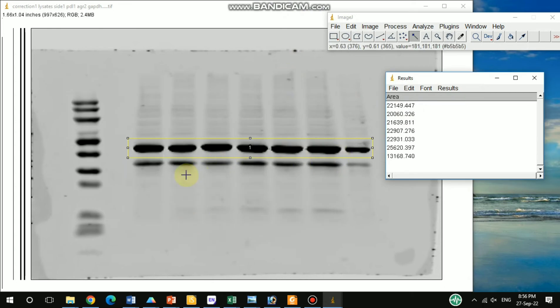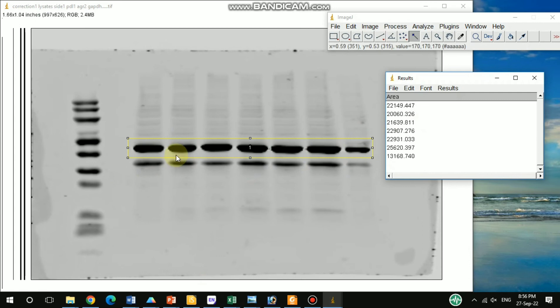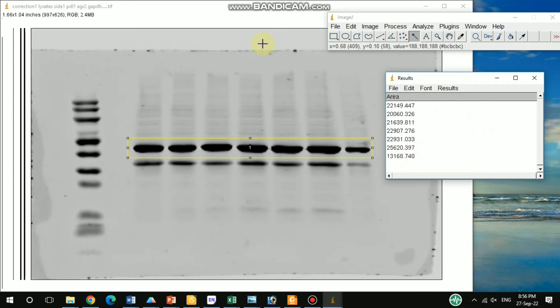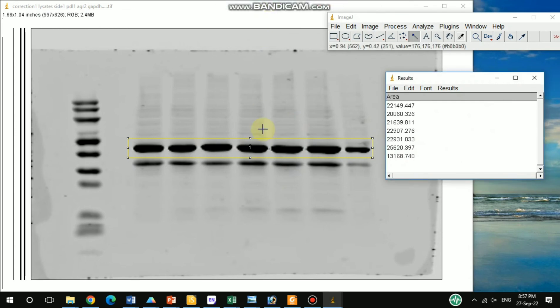If you have actin or GAPDH or any kind of loading control, you need to measure that control band intensity in the same way. Then divide the corresponding band intensity by the corresponding control band intensity to get the normalized value. That value can be used for plotting the graph.